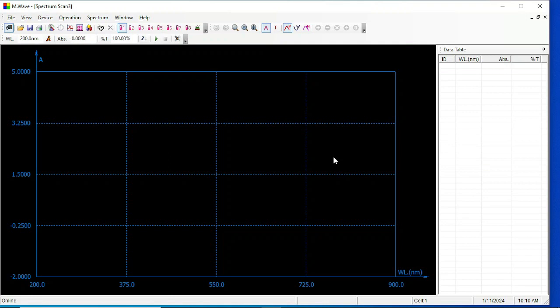Okay, right? Blanking is done. If you want to see how this water will be, whether it will give you a peak or not, you can run it also. If I run it, it should be at zero, right? It should come at zero only, right? Let's run this. I'll show it for the sake of this.